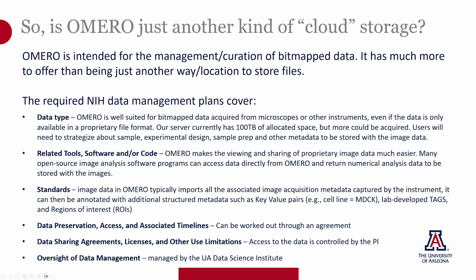Omero is not another form of cloud storage. It really is intended for curating and managing bitmap data. It can do a lot more than just stick it in a folder and let it disappear. It works with microscopes and other instruments, even if it's in a proprietary file format. We have a little 100 terabytes of allocated space, but there's the ability to get more.